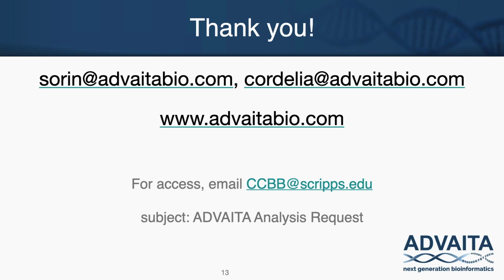Okay, so I think what the question is about GSCA is importing gene sets essentially to compare to your results. This is something that's actually in process right now. We are developing new capabilities that will allow you to look at a specific set of genes compared to your DE genes. It's not available yet, but it is coming soon.